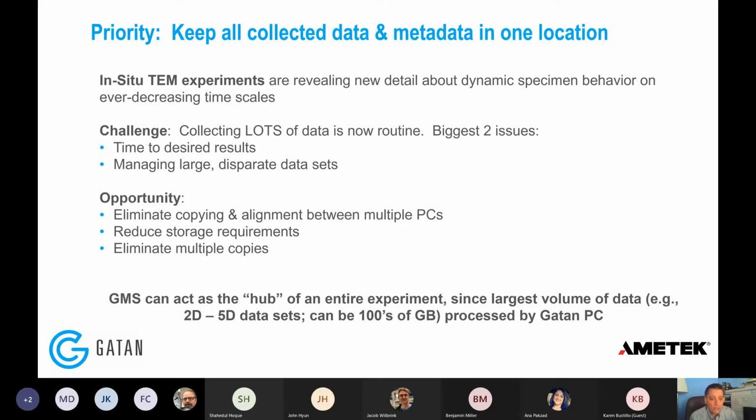And so you could talk about three-dimensional data. You could talk about four-dimensional data like we do for STEM. We could talk about five-dimensional data, STEM with a time axis in there. So you have all the tools today. The typical microscopist, in-situ microscopist, has all the tools they need to run these experiments. It's more a question of how do you herd them and bring them to bear and make them the most efficient.